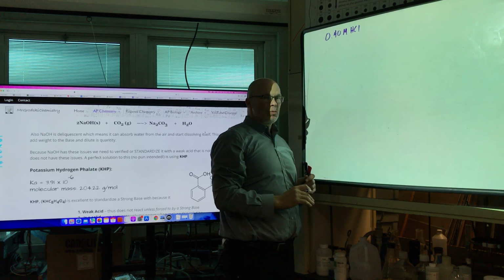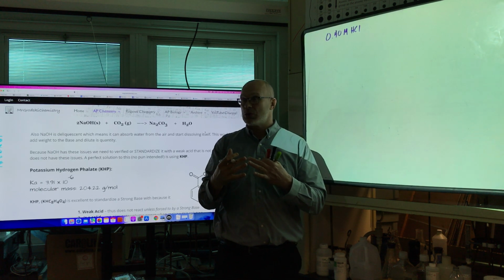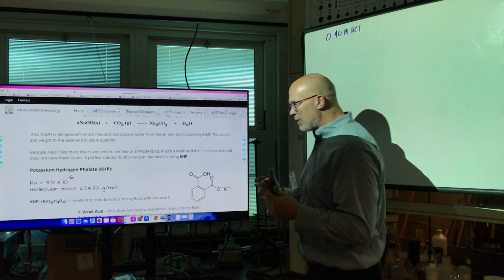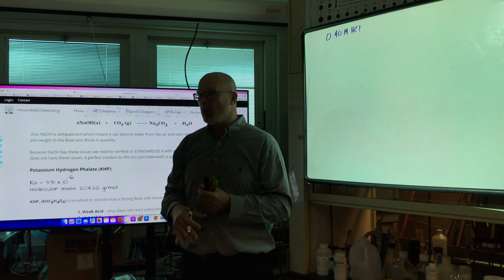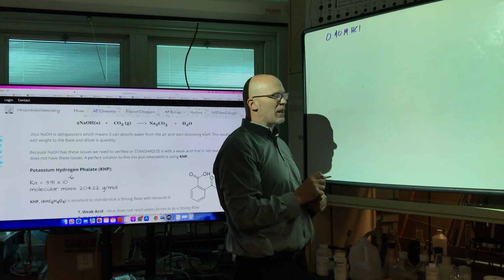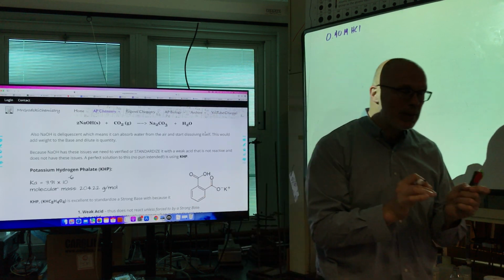Okay, we're going to add 100 milliliters of that to our two tabs, okay? And what we're going to do with that is we're going to overshoot the equivalence point so that we can drive the reaction by Le Chatelier's principle and find every little piece of calcium carbonate. Find every little piece that's hiding in the tablet.